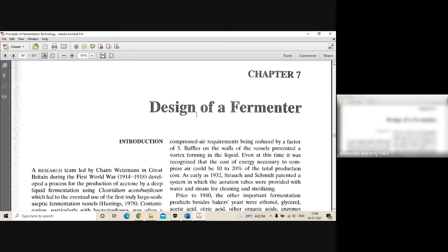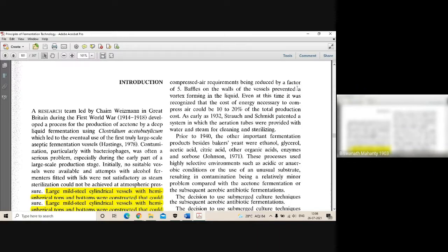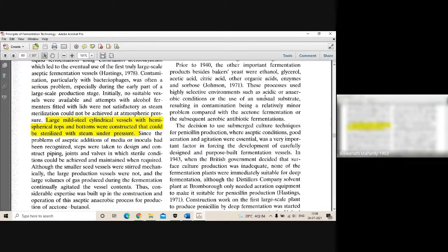So today we'll summarize very quickly what precaution level we need to have, what the shape of the fermenter is, I mean to say the constituents of the fermenter, and how it is normally made in the lab and in industry. I will not go through all the lines, you do not really need it, that is unnecessary.